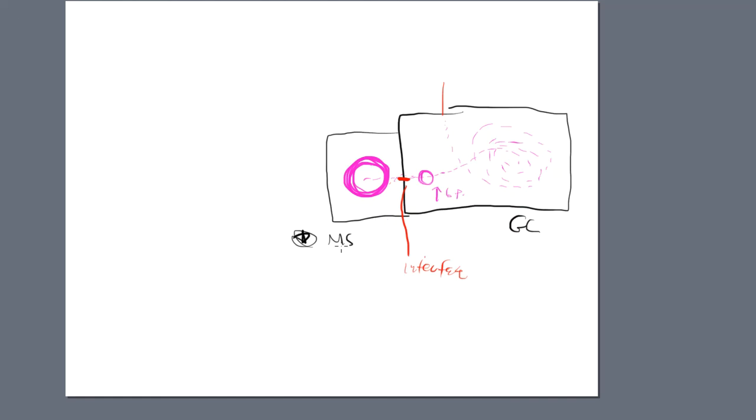In that area there's an ion source, which is an electron beam, and this is typically in a housing, and this housing is also heated. We need that heated because, again, we do not want those compounds to turn into a liquid in the mass spec chamber, contaminate it, and sit there and cause us problems later down the road.